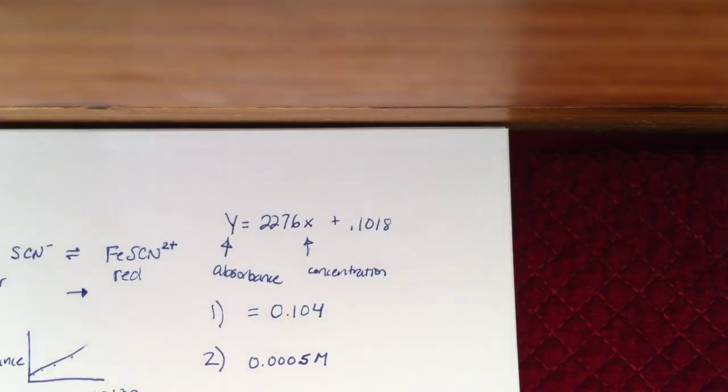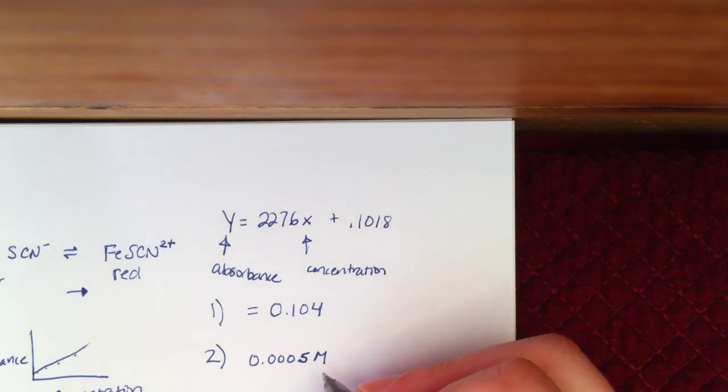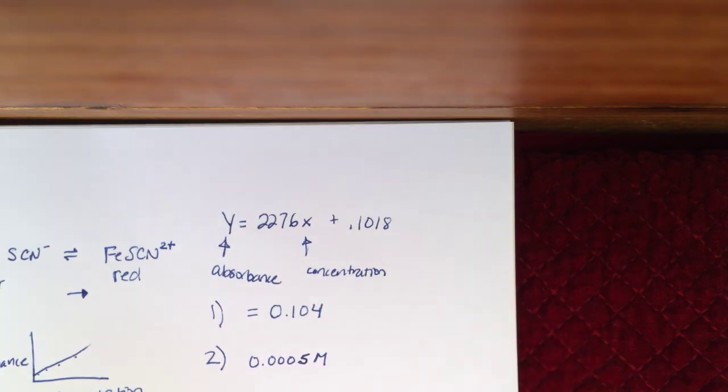There's lots of different reasons for this error. We think that the main reason is probably the calibration, and also the fact that we're using such small quantities of these substances. That cuvette was very small. So that's going to mean that being slightly off could have a big impact on our data.